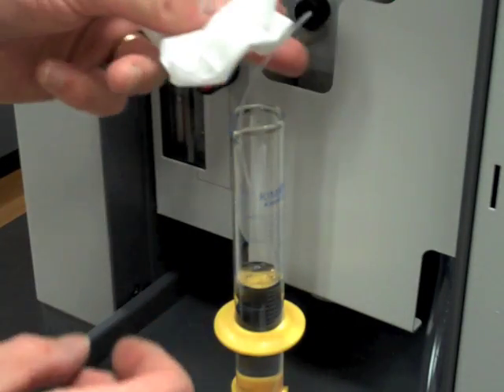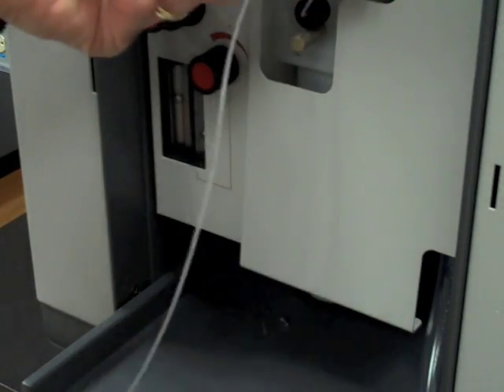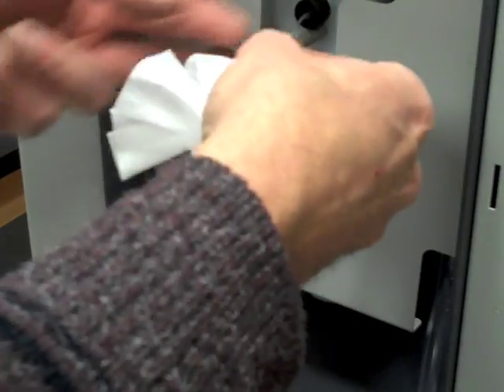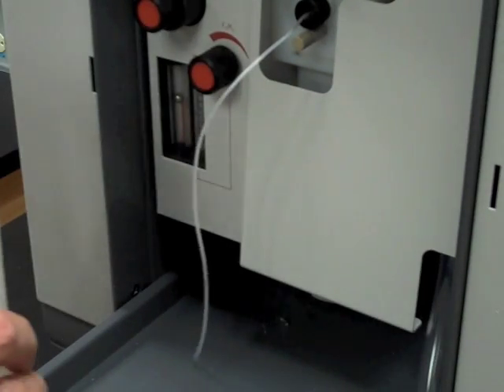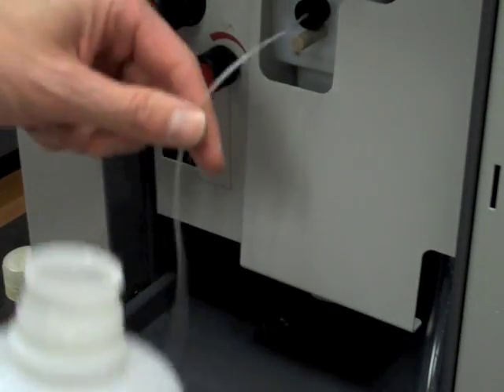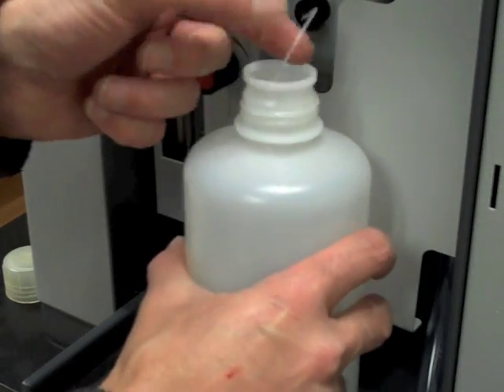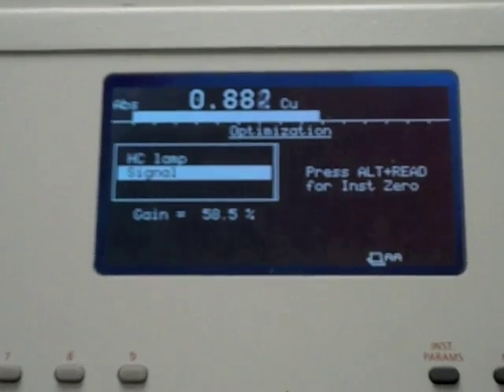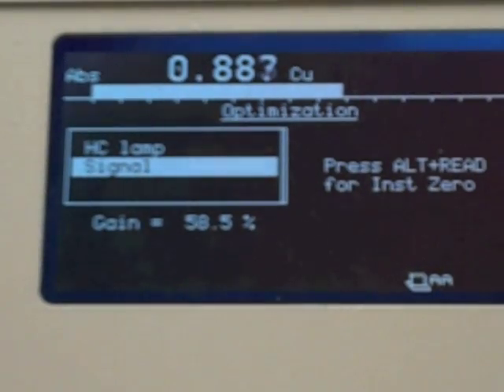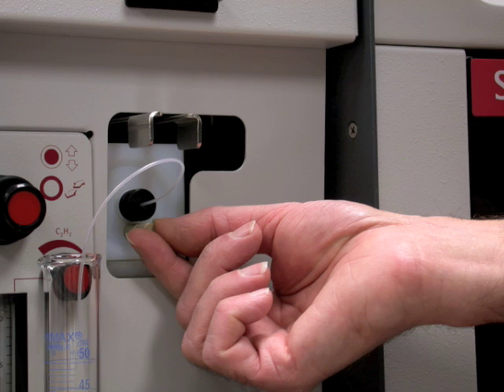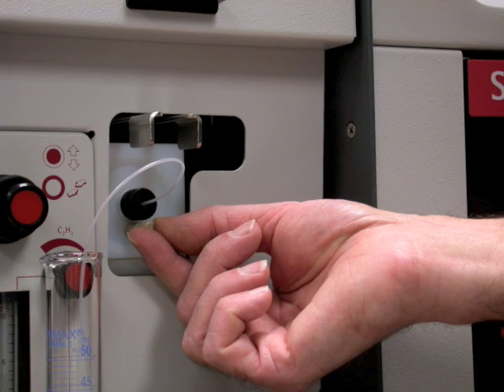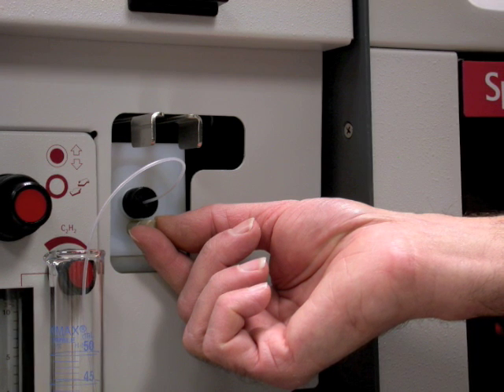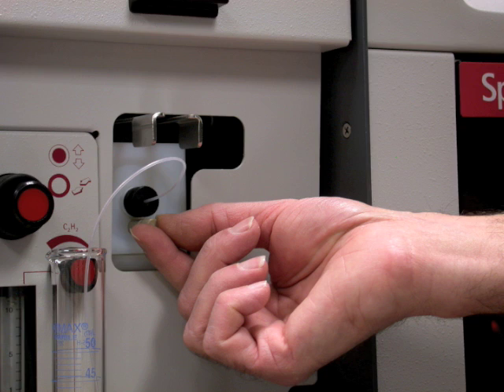Begin by aspirating solution from one of your standards — one of the more concentrated ones. Maximize this signal by moving the burner head in and out and up and down. You may also want to adjust the acetylene ratio. Another critical feature is the rate at which the solution is aspirated into the flame. This can be controlled by moving the needle for the spray nozzle small distances with the adjustment screw. Please ask the instructor for help if you wish to adjust this parameter.